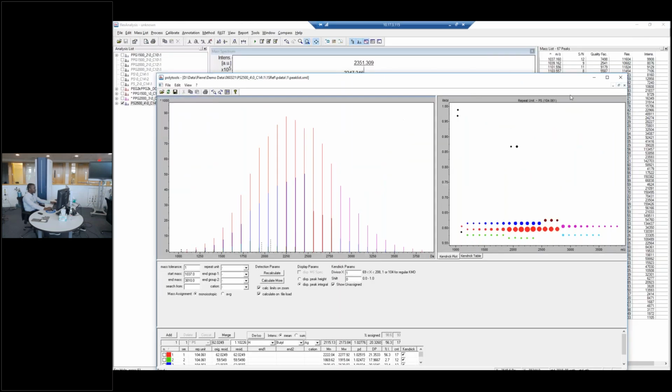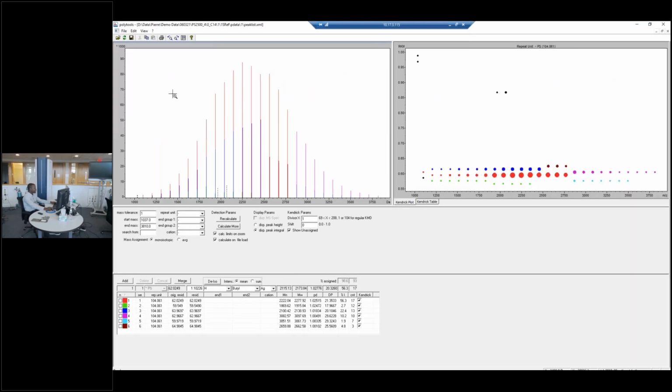And Polytool is our dedicated polymer analysis software, and this is where you basically get to calculate all of the interesting polymer characteristics that any polymer chemist is interested in. So things such as molecular weight, polydispersity index, the degree of polymerization of your sample. If you have different mixtures and different end groups, Polytool will give you basically a better understanding of what you have in your sample.